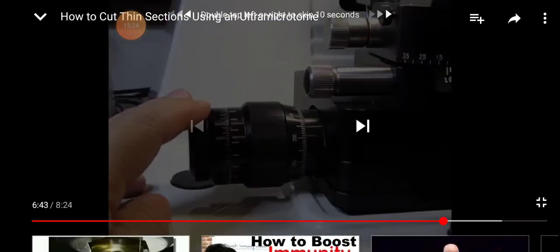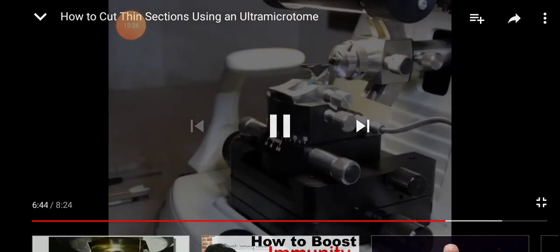Not like in other microtomes. The knife is very small because it is made of diamond or glass, or most often a gem quality diamond knife is used here. So it is very small. Can't see it anymore. Now you know that we're just really close, and we'll just take small thin sections. We're going to let the motor do the work.